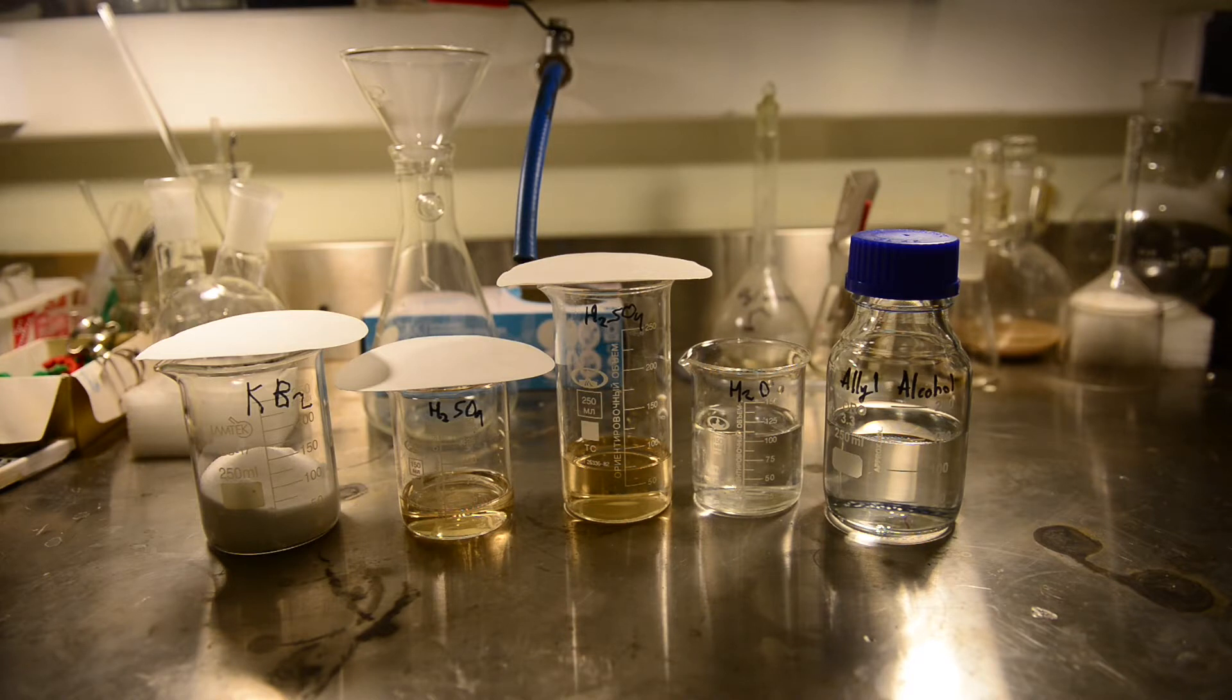Today we are going to brominate the product we got in the previous video, allyl alcohol. The product of this bromination reaction is allyl bromide, a very useful reagent and building block in organic synthesis, especially for Grignard reactions.